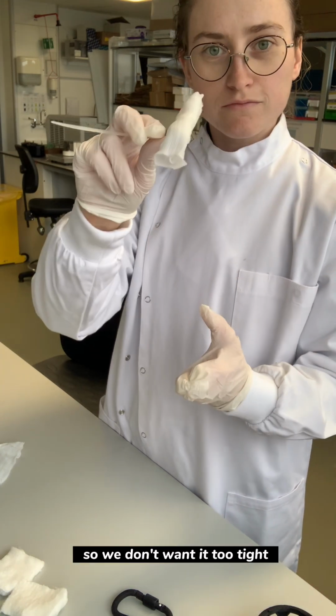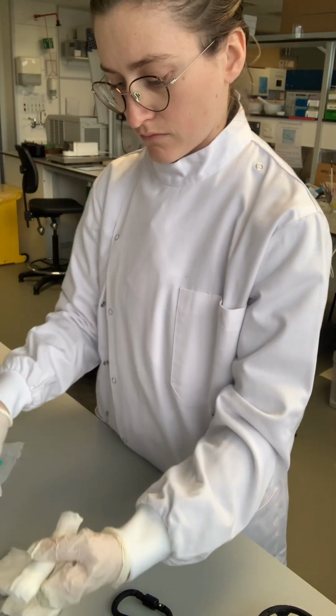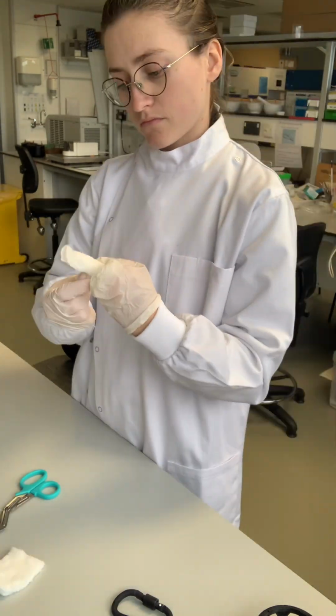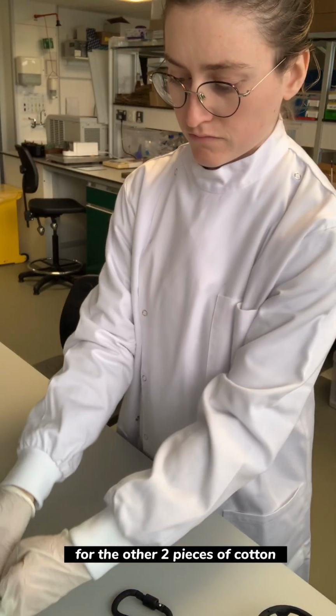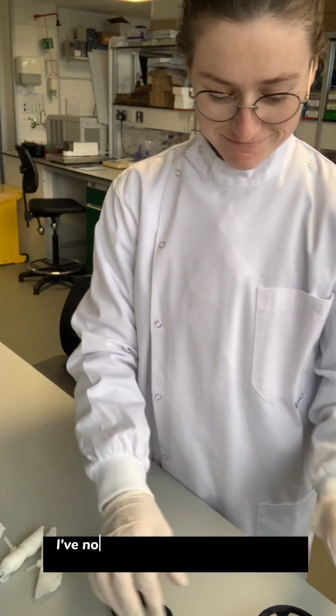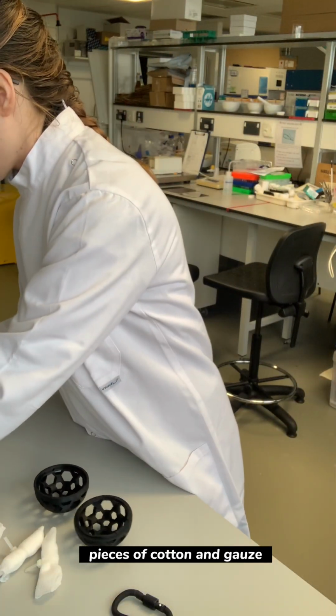So we don't want it too tight where it makes it really hard to get off, but we want it just tight enough that it holds it together. You'll find that middle ground with a bit of practice. I'm just repeating that for the other 2 pieces of cotton, and there you can see I've now got 3 prepared pieces, rolled up pieces of cotton and gauze.